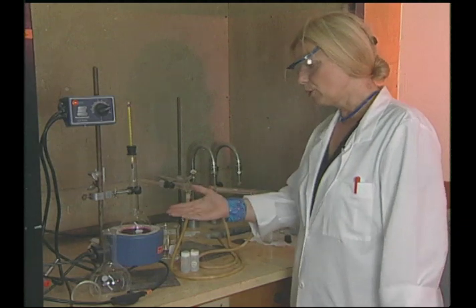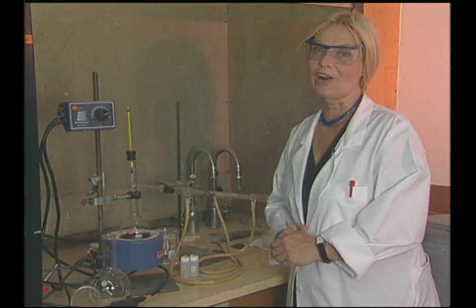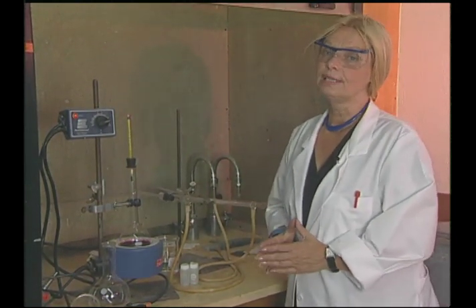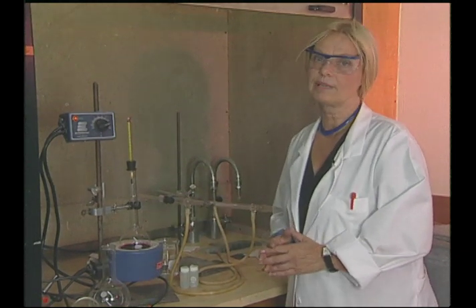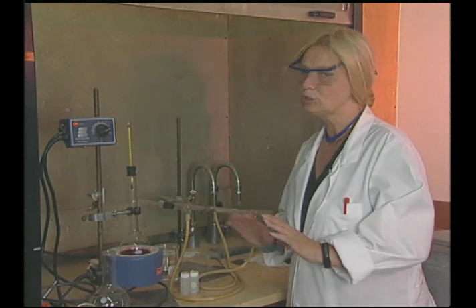And we could wait till everything is distilled off. We should never distill absolutely to dryness, because remember, the other component of the mixture is solid. So we will see the crystals forming if we would really boil off the liquid completely. So we don't do it all the way.